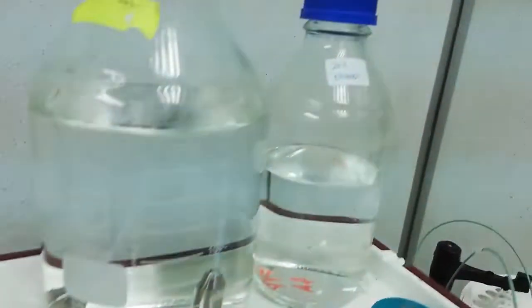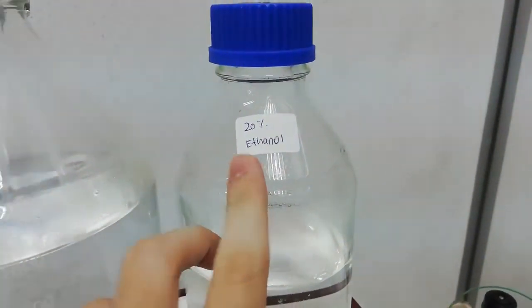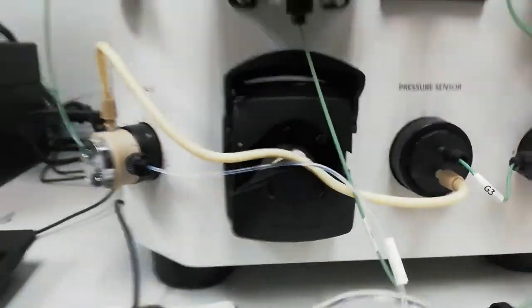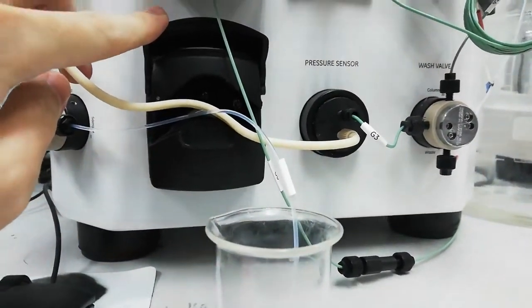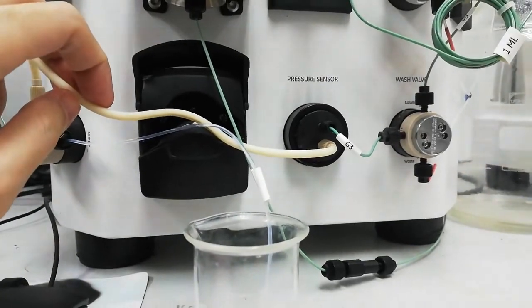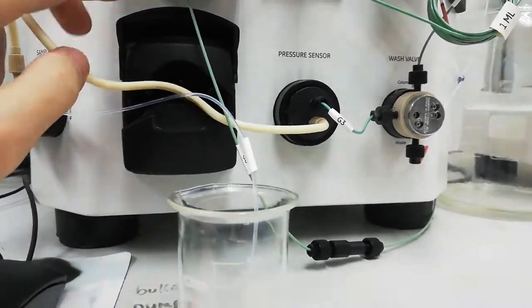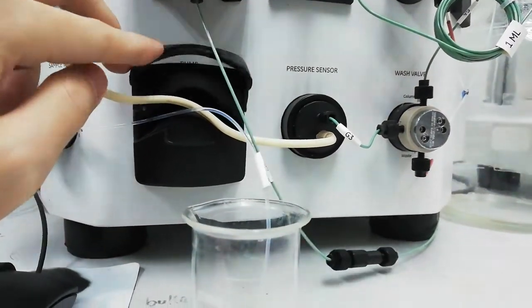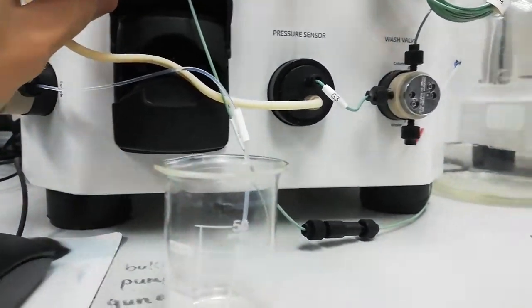Before starting the ATASA system, we are going to take out pipe B and it must be set to 20%. That is done. The second part is the pump. As you can see, the pump cover is open and the wire is placed outside, so before starting it we have to put this white wire inside and then close the cover.